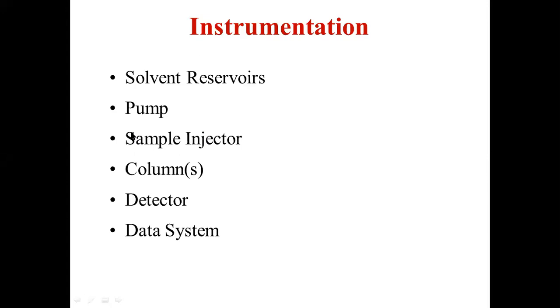And there is no difference with respect to the sample injection system or the sample introduction. Here also we will use loop injectors or a hypodermic microsyringe. The solute present in the sample which was in the solid state has been converted into liquid. Several milliliters or microliters of the solution can be taken in the microsyringe and easily injected into the injection port of the chromatographic column.